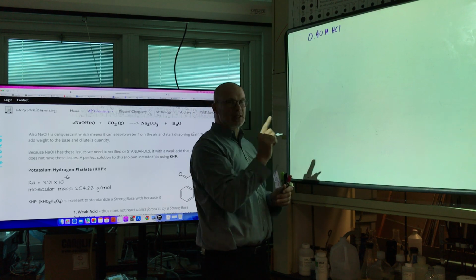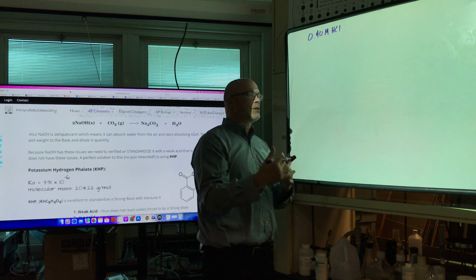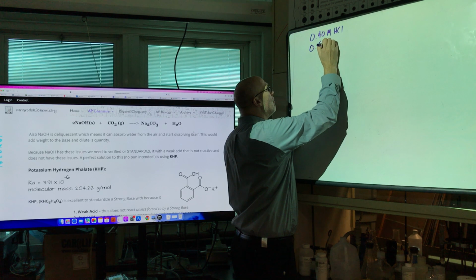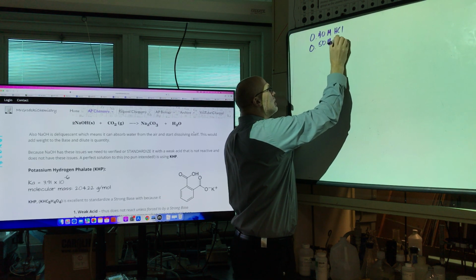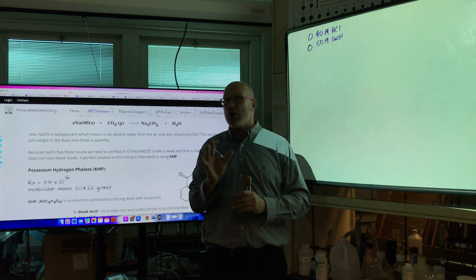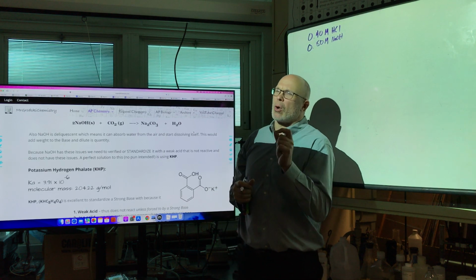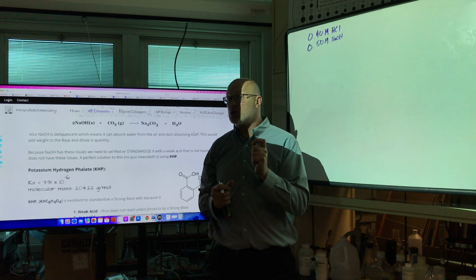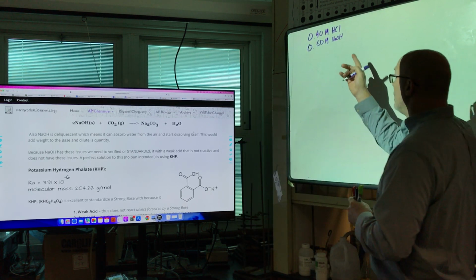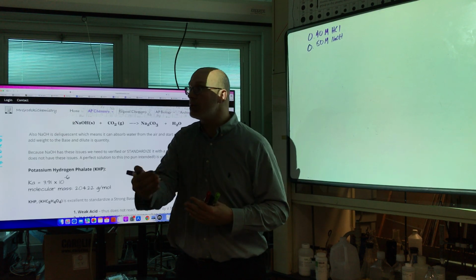All right, we also discovered through arbitrary values and again target amounts that we need to make 0.50 molar NaOH. So how do we make these solutions? Okay, well, a titration that we're doing today, a back titration, is only as good as the quality of the standard solutions we start with. If we don't start with very, very accurate solutions, then we're not going to get accurate results. Accuracy is how close we are to a known.